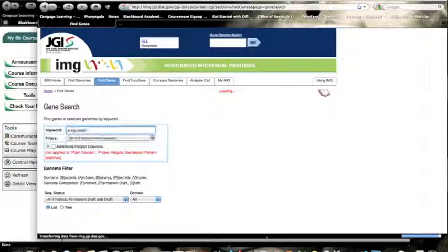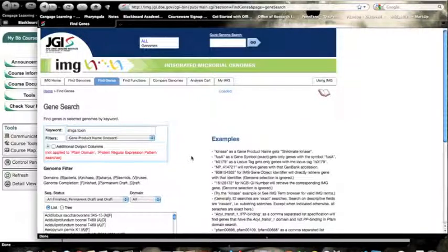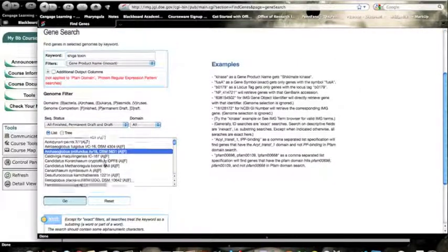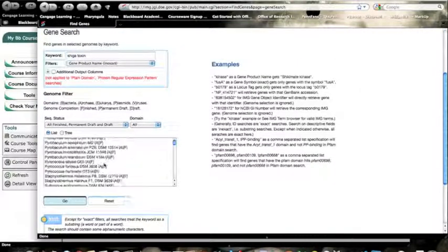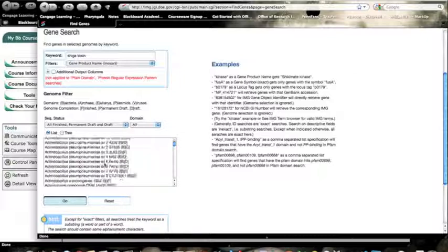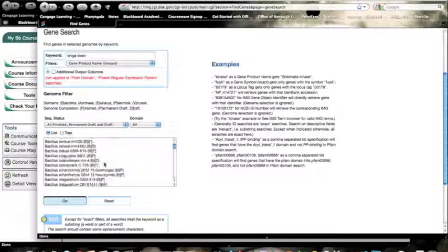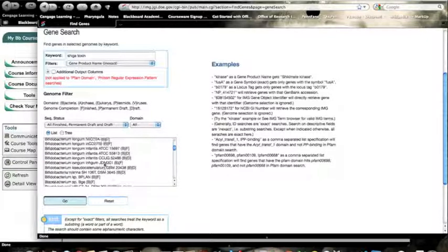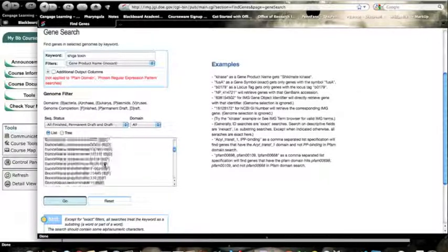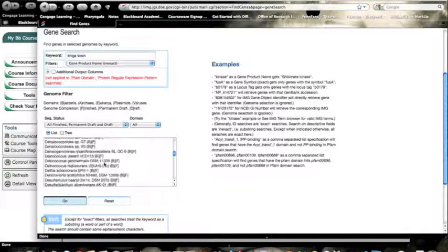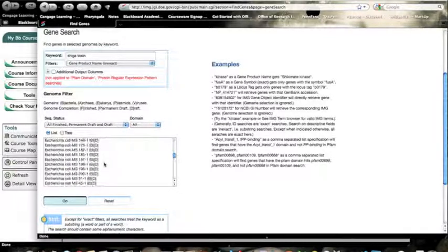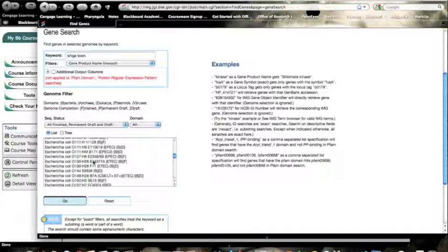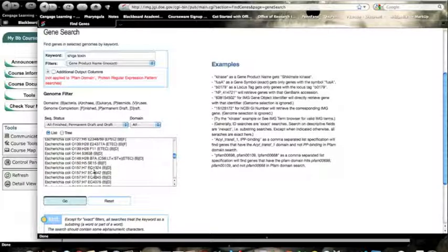You can see I've searched for it already. Now we need to find out which organism to look for in it. We don't want to look through all organisms, but we'll scroll way down to Escherichia coli. You can see it's alphabetically ordered. So O157:H7.